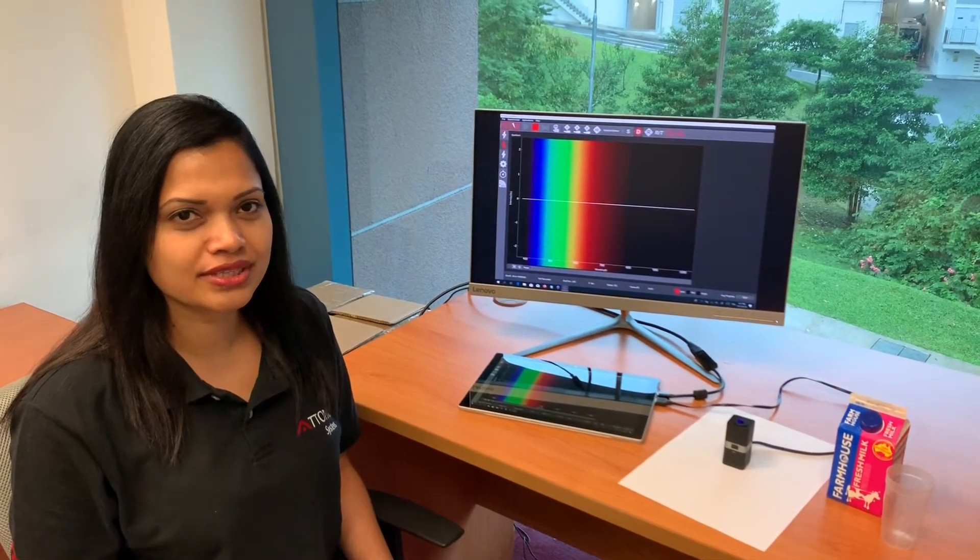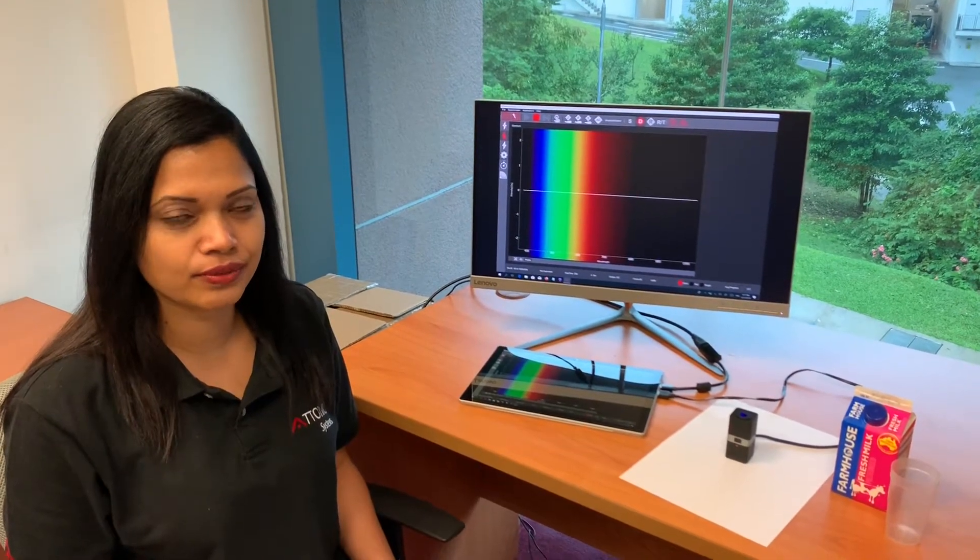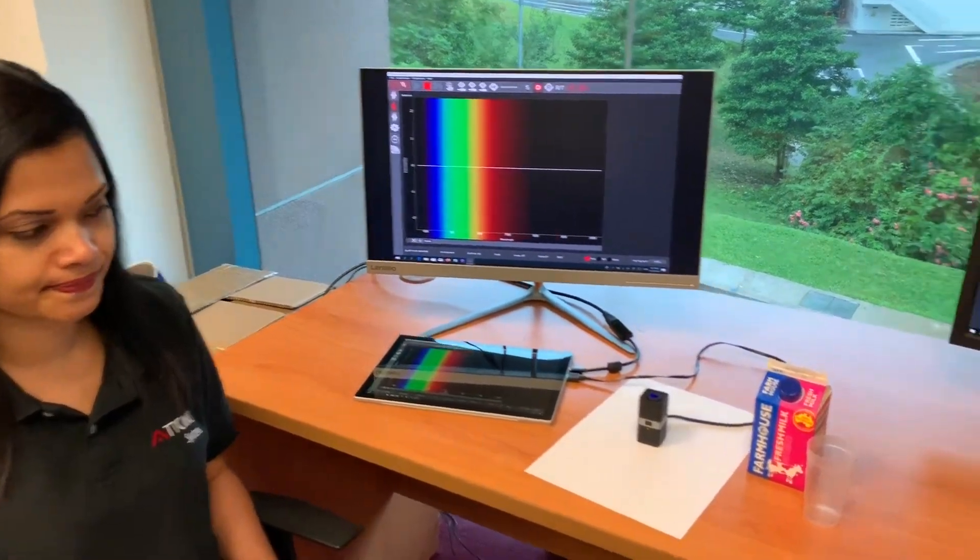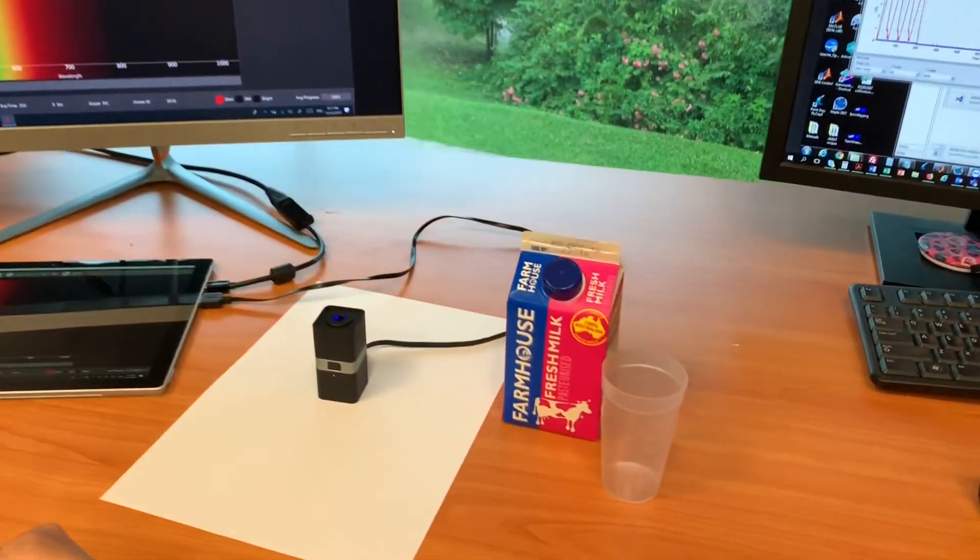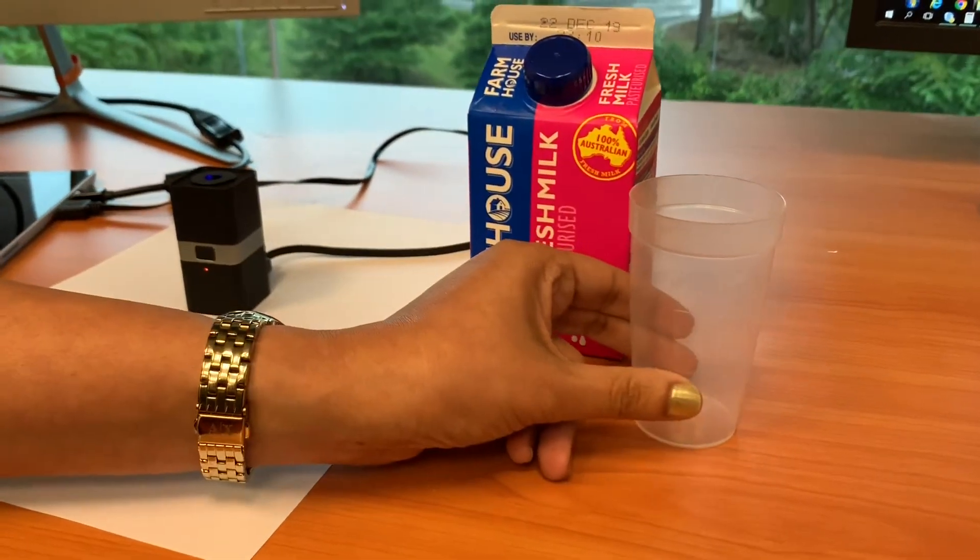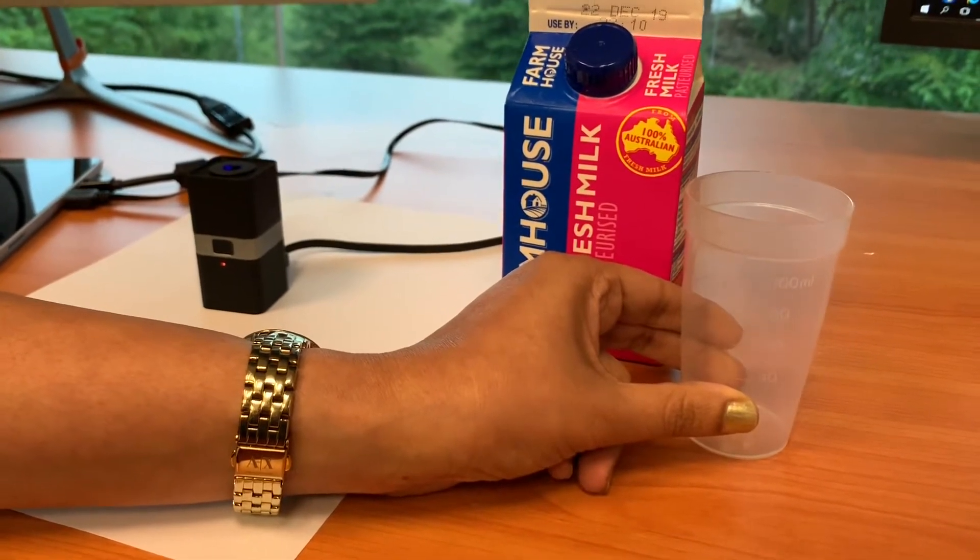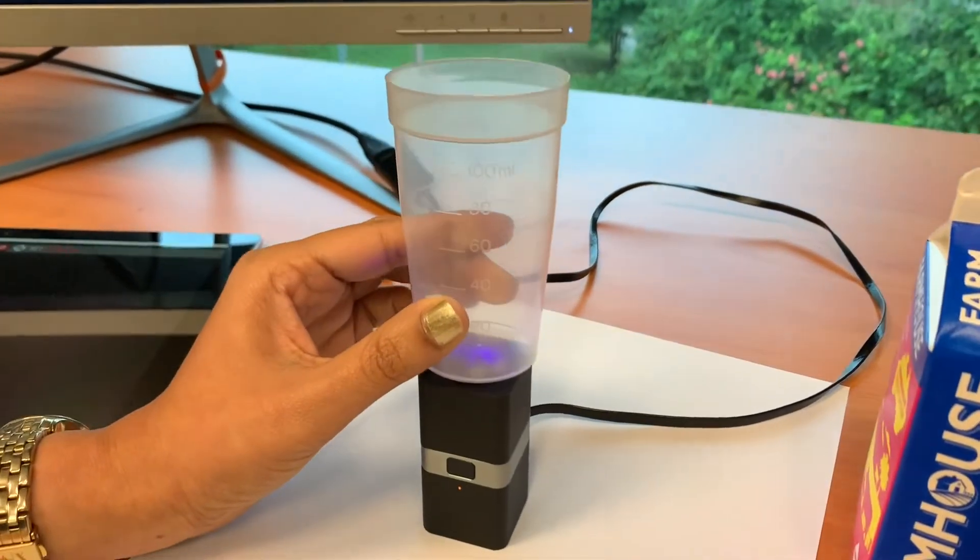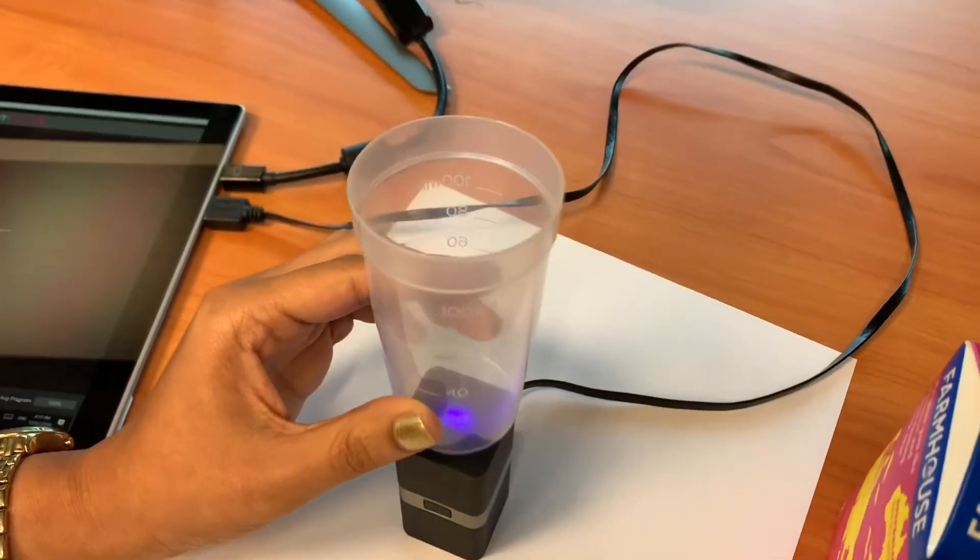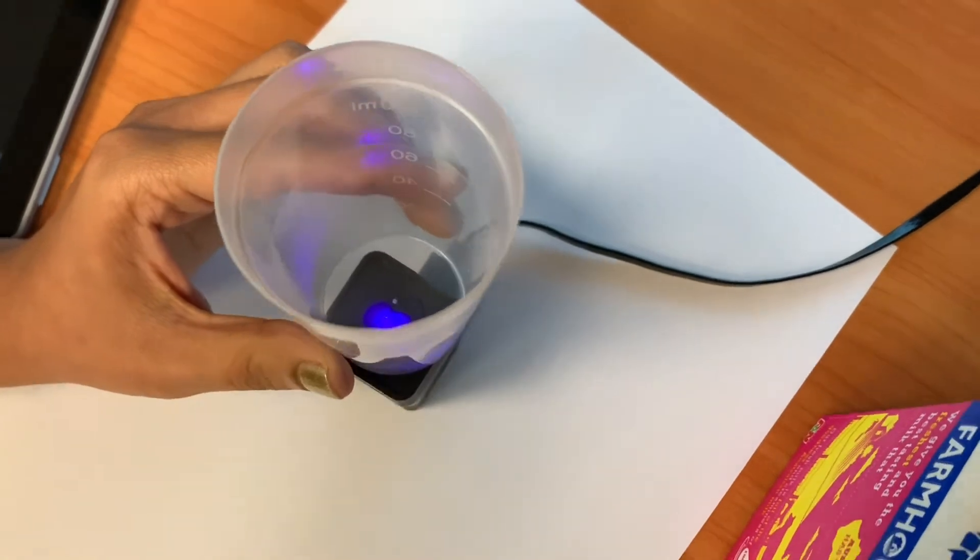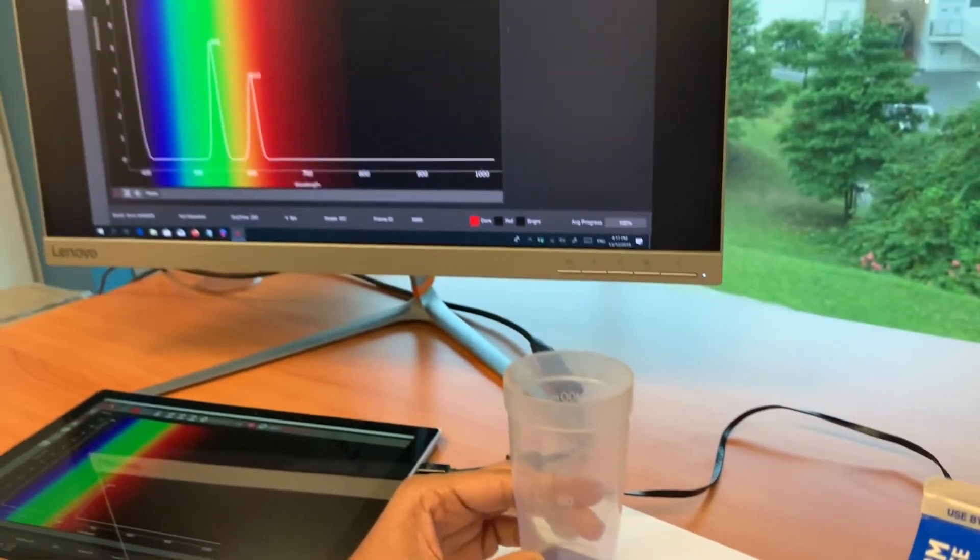The measurement procedure is the same as demonstrated in the previous video. The only difference is the sample holder. Since milk is a liquid sample, we will place it in a plastic container. First, a dark spectrum is acquired with the empty container on top of the illumination unit to remove stray light and environmental lighting from the spectrum.